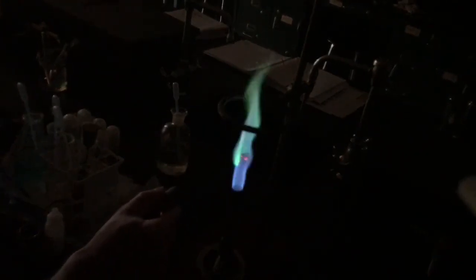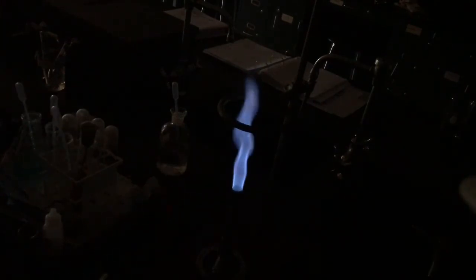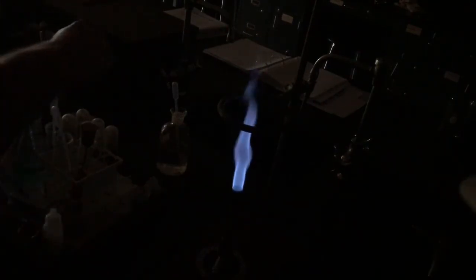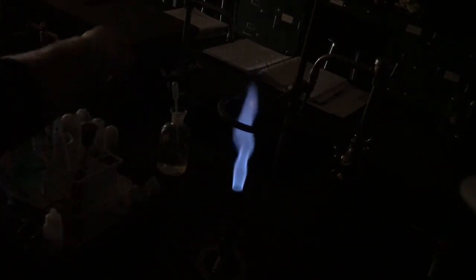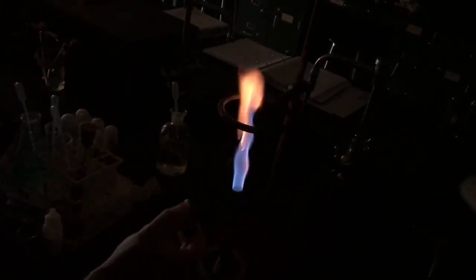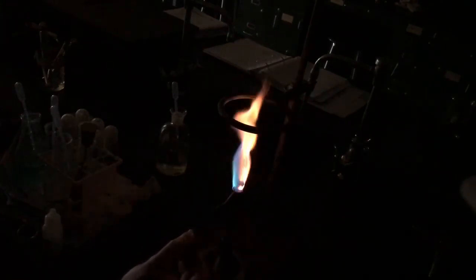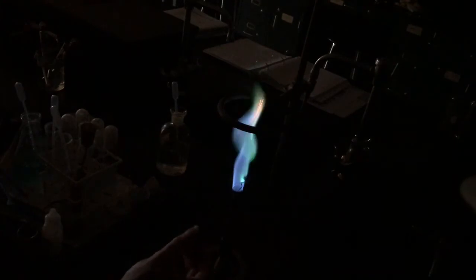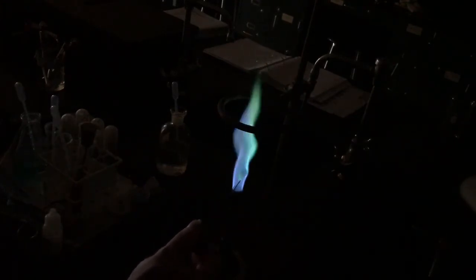Okay, so now that we've done all of our flame tests and we looked at what each one looks like, we're going to see what our unknown is going to look like. Okay, so we're going to clean it again. You got a little bit of everything on it. That's why, especially this copper, it likes to stick.